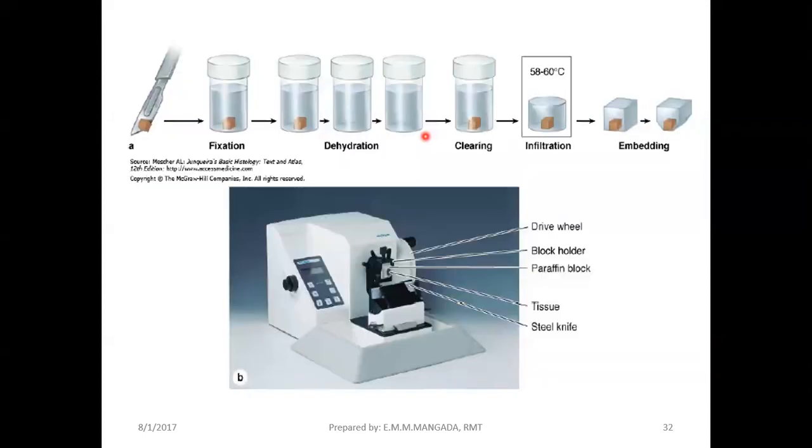So guys, we have here a picture showing you a summary or a simpler diagram of our processes. Number one is of course yung letter A. Anong ginawa niya? We have there a scalpel and the tissue. This is actually known as your grossing. It's actually the pathologist.